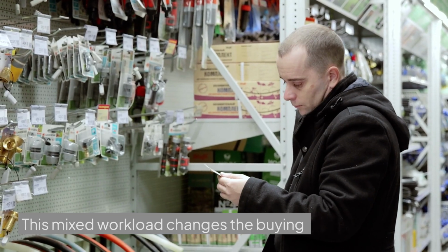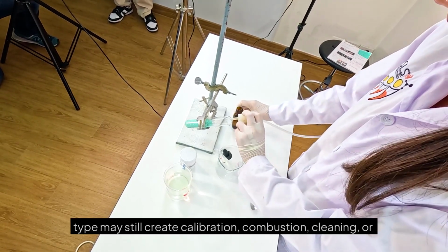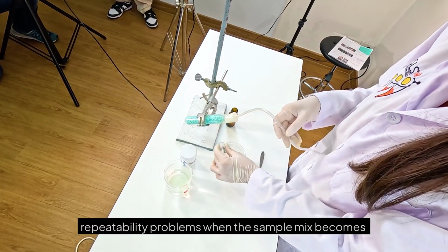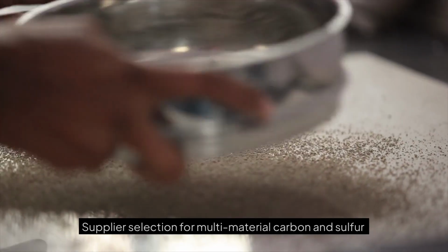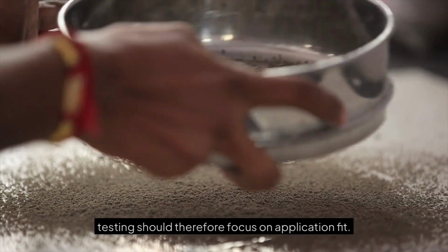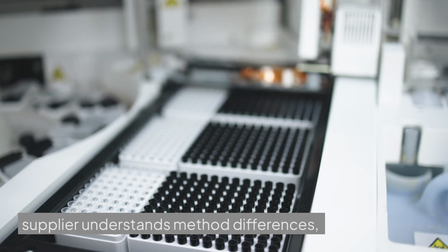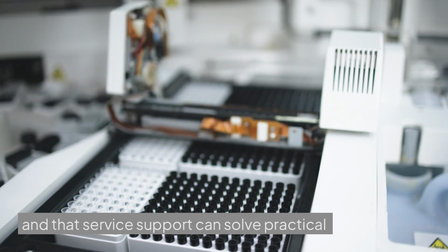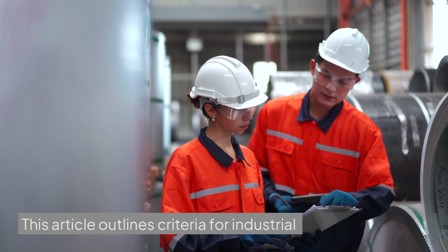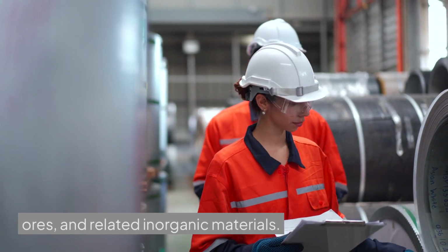This mixed workload changes the buying decision. A carbon-sulfur analyzer that performs well for one material type may still create calibration, combustion, cleaning, or repeatability problems when the sample mix becomes broader. Supplier selection for multi-material carbon and sulfur testing should therefore focus on application fit. Buyers need evidence that the analyzer can handle the expected materials, that the supplier understands method differences, and that service support can solve practical laboratory problems. This article outlines criteria for industrial laboratories testing steel, alloys, cement, ores, and related inorganic materials.